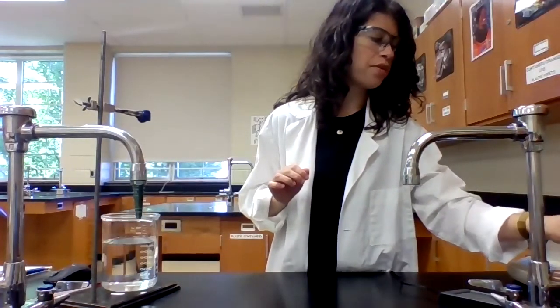Then I need to measure the mass of the magnesium ribbon. The magnesium ribbon is pretty small, and the reason it's small is that we're going to be collecting the gas inside this eudiometer. The eudiometer can only hold 50 milliliters of gas. So I don't want to use too large a piece of magnesium ribbon such that I generate more than 50 milliliters of hydrogen gas. I need to keep my volume of hydrogen gas contained inside this eudiometer.